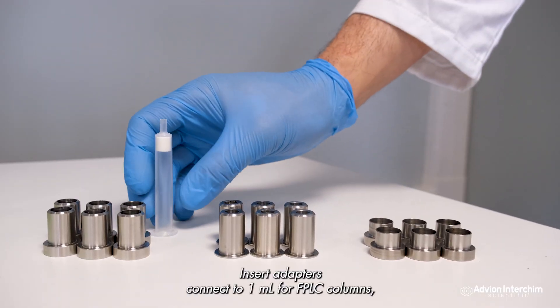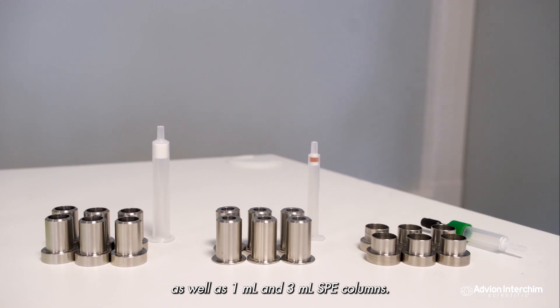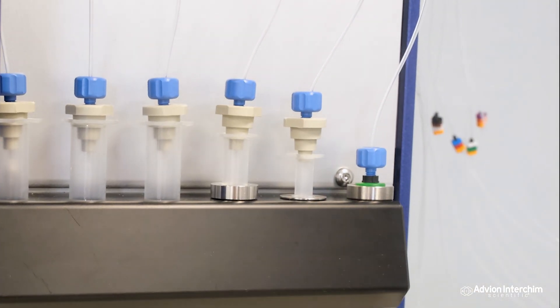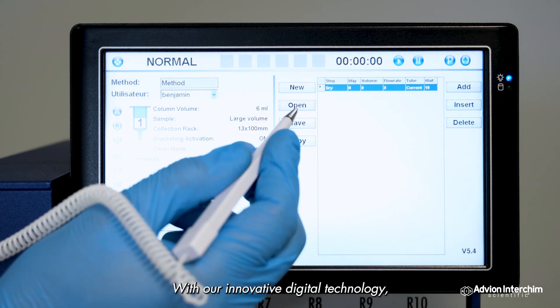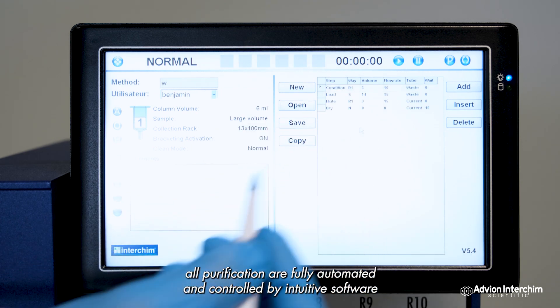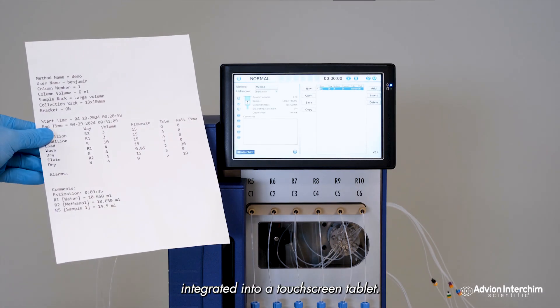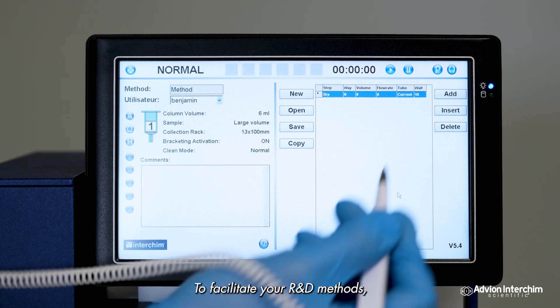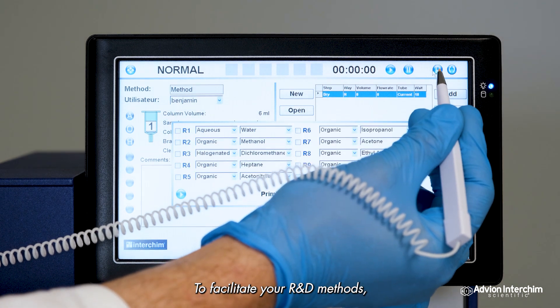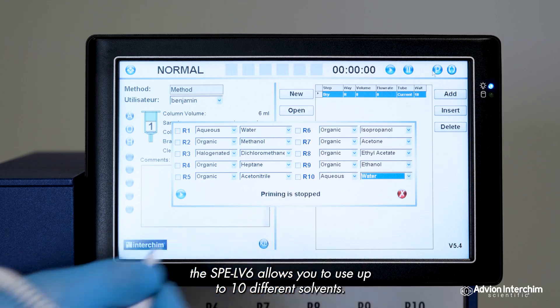Insert adapters connect to 1 milliliter FPLC columns as well as 1 milliliter and 3 milliliter SPE columns. With our innovative digital technology, all purifications are fully automated and controlled by intuitive software integrated into a touch screen tablet. To facilitate your R&D methods, the SPE LV6 allows you to use up to 10 different solvents.